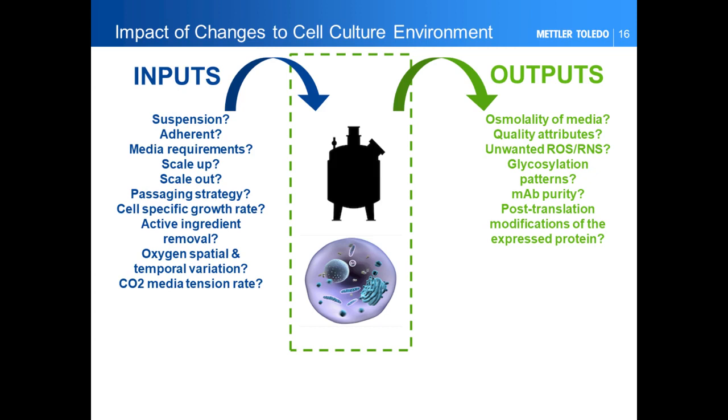As an example, a set of inputs could be drafted like this when looking early at parameters that would impact performance and goals when designing a process model. And this is why, beyond pH control, measuring dissolved CO2 could become more valuable as a CPP.